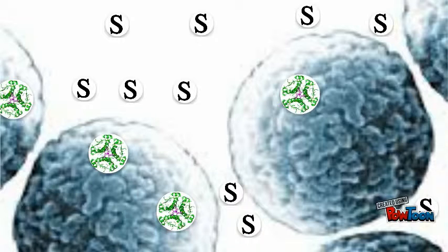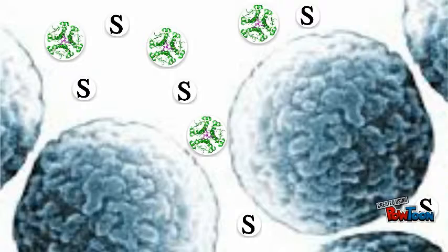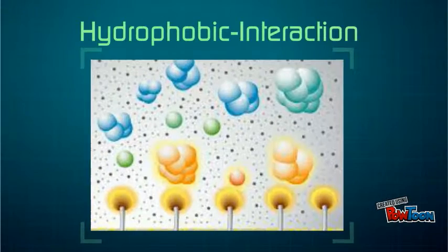To elute the proteins, a salt gradient is used, and this process can be assisted by detergents and by organic modifiers. This method of chromatography is done in order to purify a protein solution while allowing it to retain functionality.